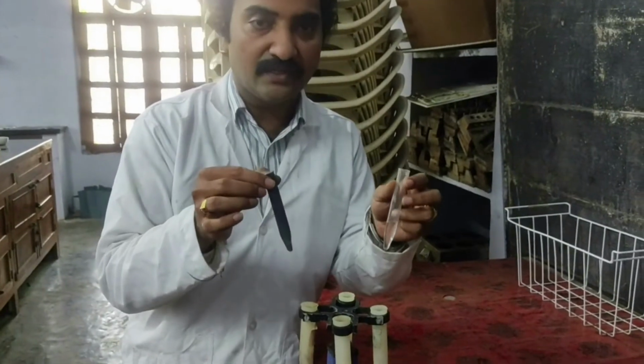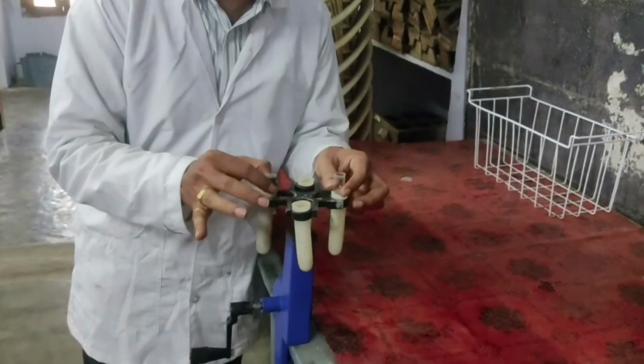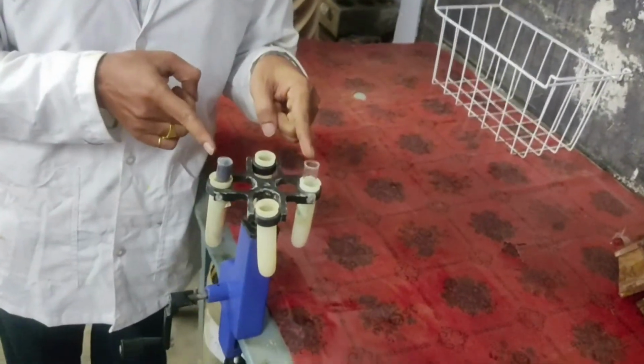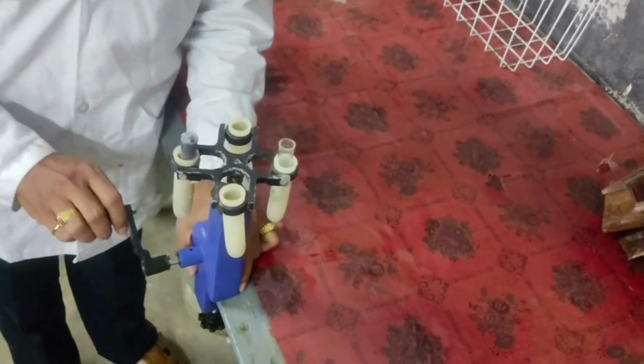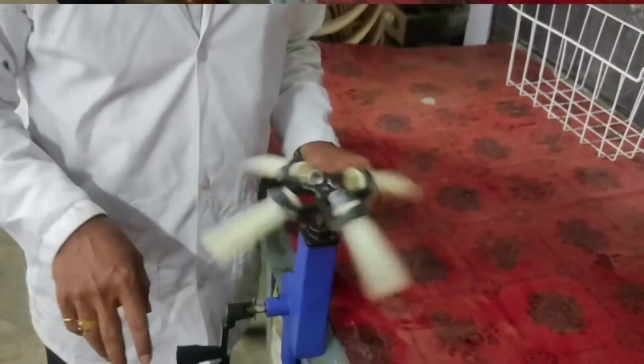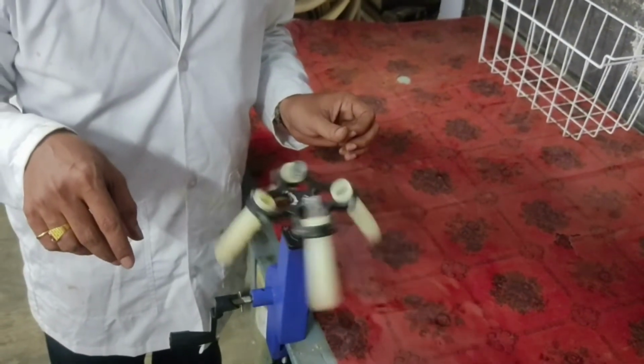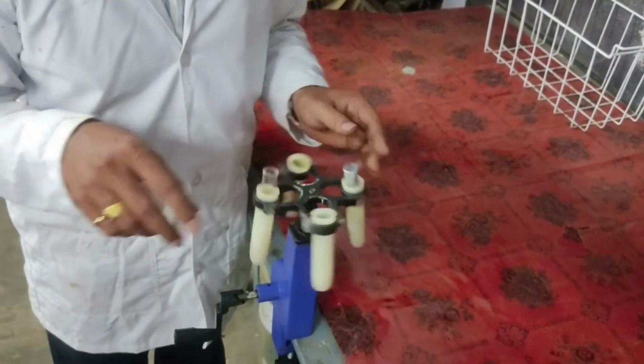Now I am going to insert the test tubes into the opposite holders of the hand centrifuge machine as shown here. Okay, slowly you start centrifuging. Accelerate it now. So centrifuging is almost complete. Let me check whether the residue got separated or not.